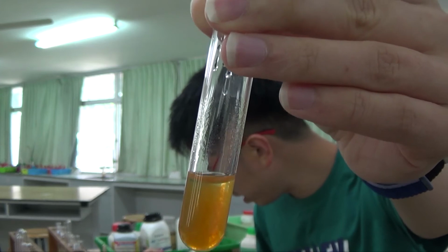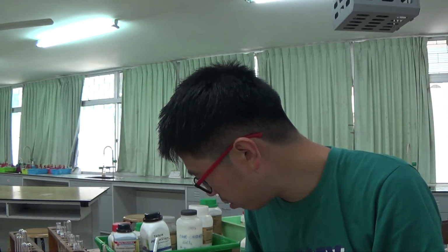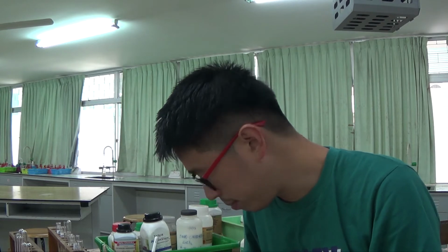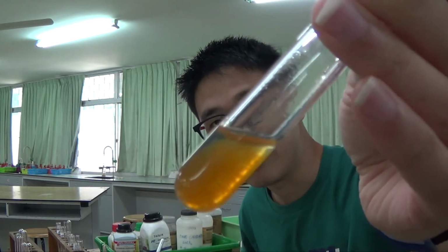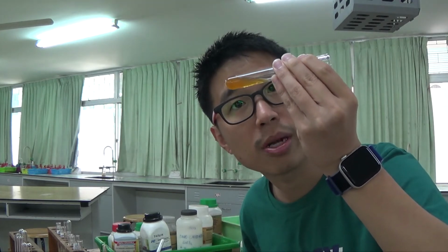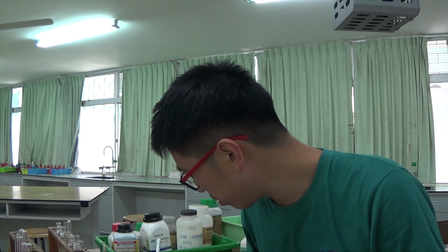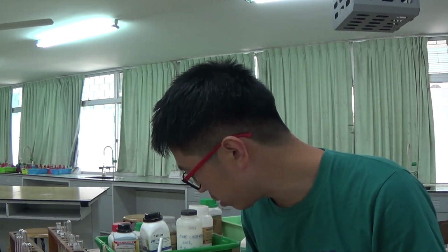With ammonia, you get a reddish brown PPT. This looks more orangey. In reality, when you have pure iron 3, the precipitate is supposed to be more reddish brown. But this is straight from your qualitative analysis notes, the table that you were provided.